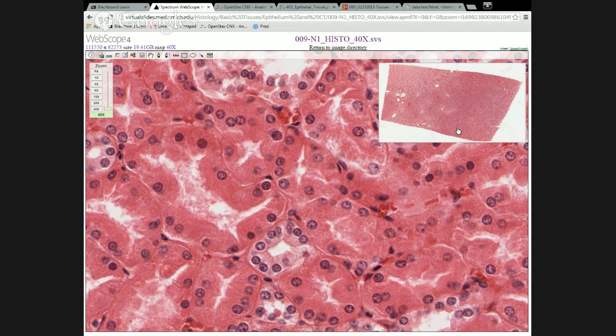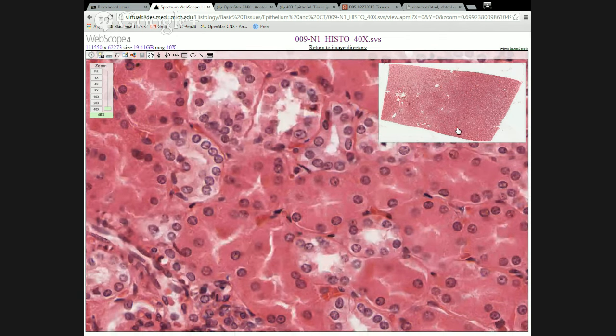Now, if we jump around, I just randomly picked another spot here. We can see some more of these more lightly stained epithelia lying around here, but then some of the more darkly stained. And if you start to stare at this stuff long enough, you can start to make out the empty space in the middle and what looks like a defining line around the outside, even one of these dark ones here. Okay. Doesn't necessarily have to be quite as straightforward as the more lightly stained ones, but we can see that. Okay.